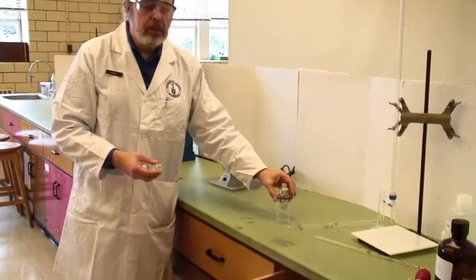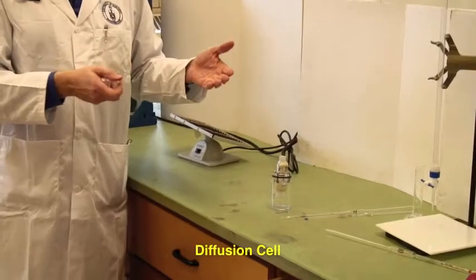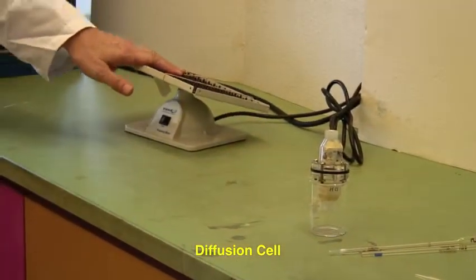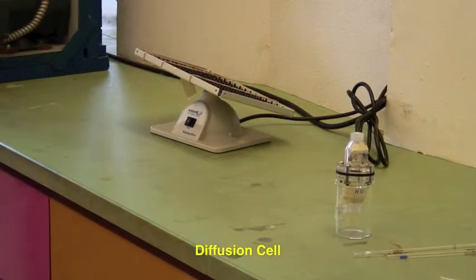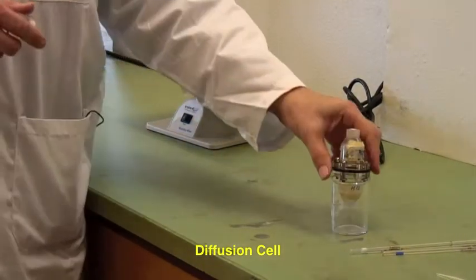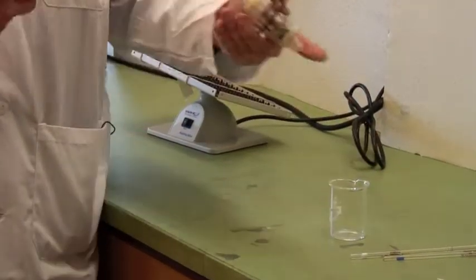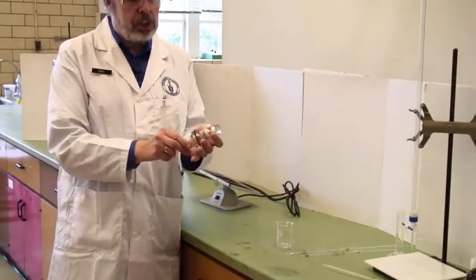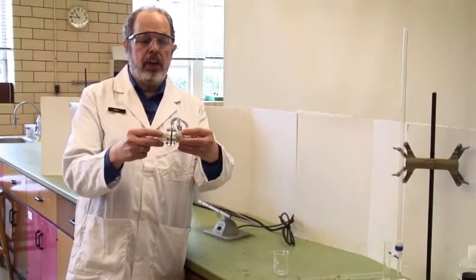You will be filling them with material and then you'll be agitating them. We've got a plate agitator and a mechanical agitator here. And then you'll be analyzing the results of how fast material moved through the membrane, which is actually in the middle of this here.